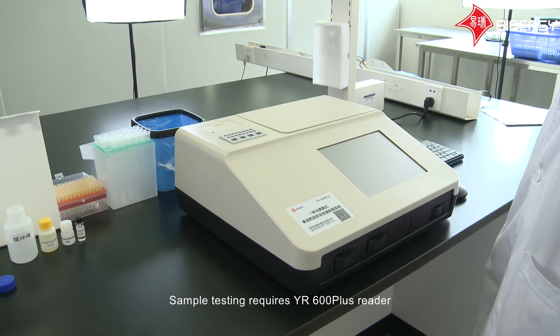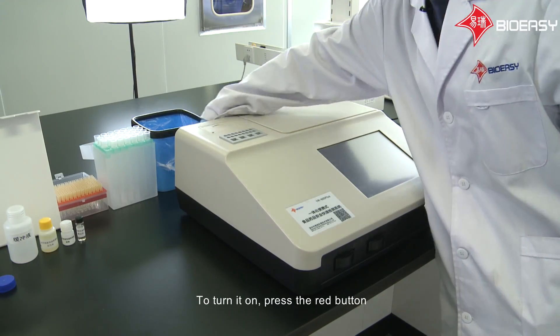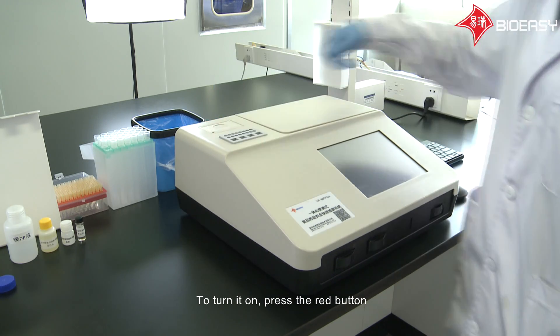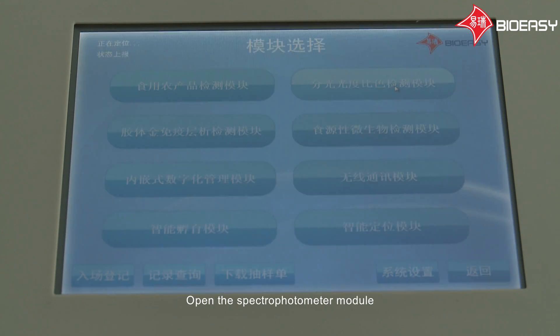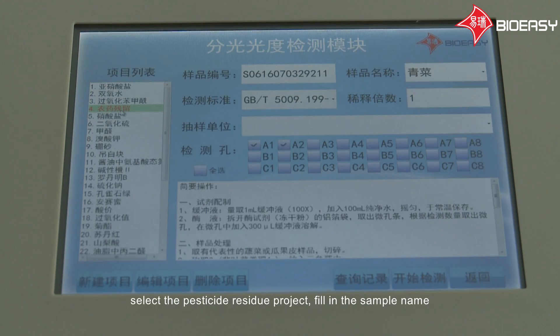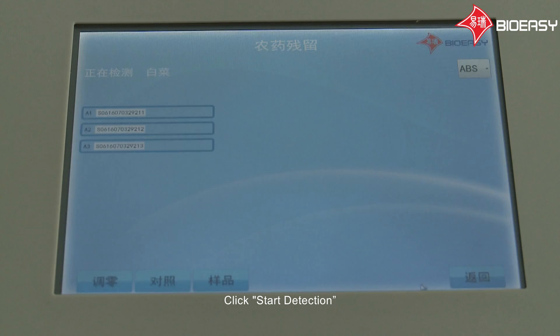Sample testing requires the YR600 Plus Reader. To turn it on, press the red button. Input your username and password, then log in. Open the Spectrophotometer module, select the pesticide residue project, fill in the sample name, and select the hole according to the number of samples.